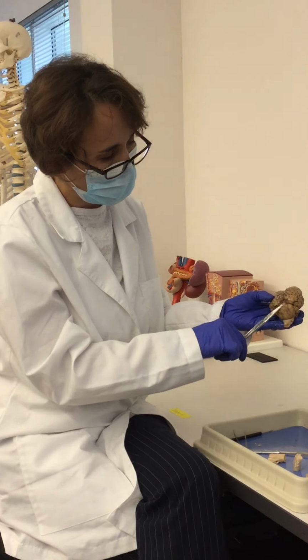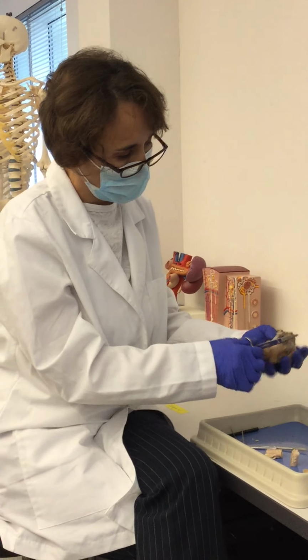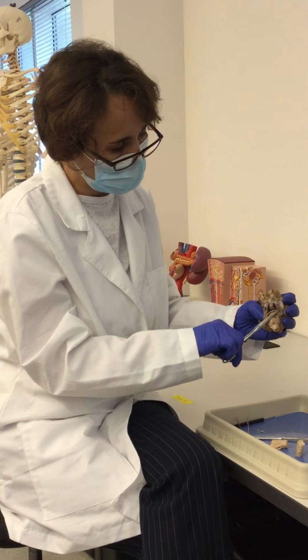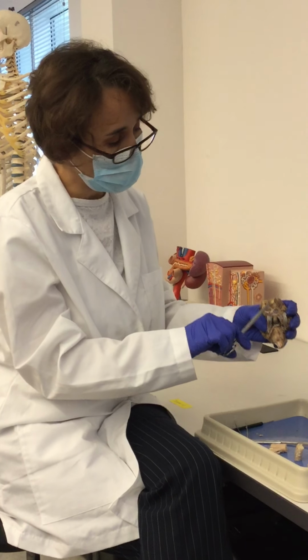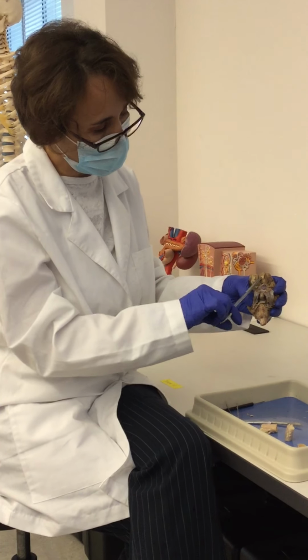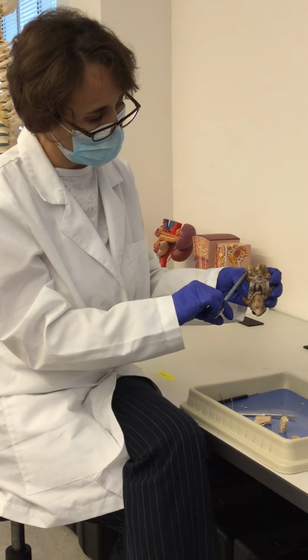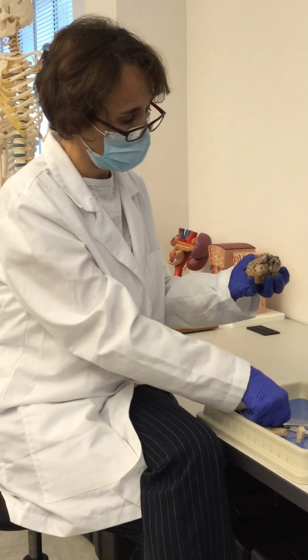So again, this is the right hemisphere of the brain, left frontal lobes, parietal, occipital, temporal, then this cerebellum, medulla oblongata, and this is the pons, and here we have the pituitary gland and optic chiasma still covered by the dura mater. And these nerves that you see here are the olfactory nerves, specifically the olfactory bulb, which is a dilation of the olfactory nerve.